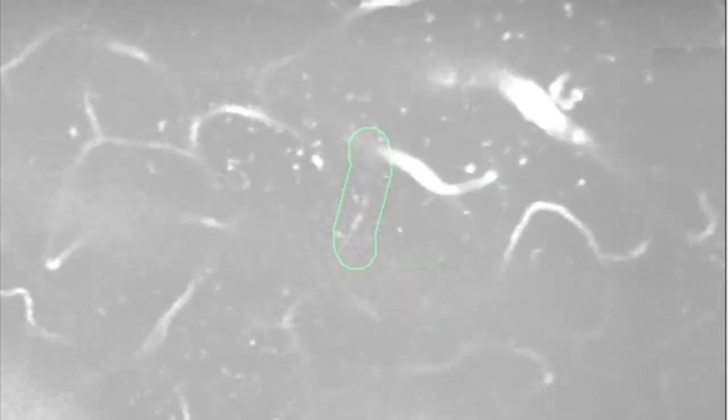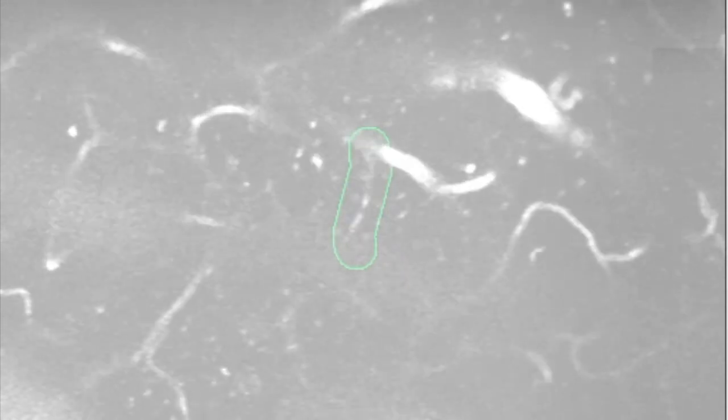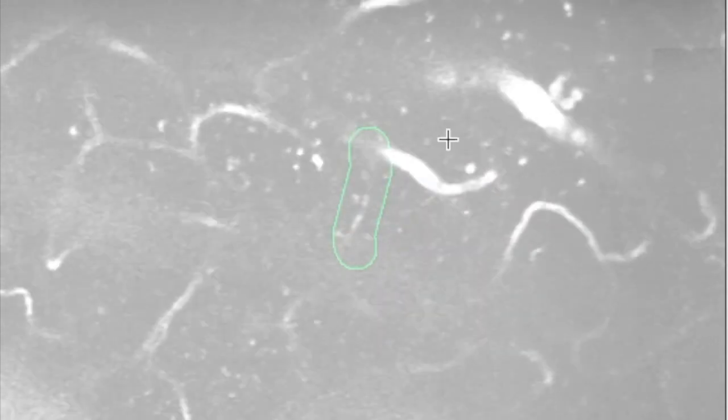Here's another example of a beginner video. As we scroll through the vessel, we again see the black spots not moving in the white flow. An interesting thing about this image is that the contrast is a little off, so the entire image is fairly bright.